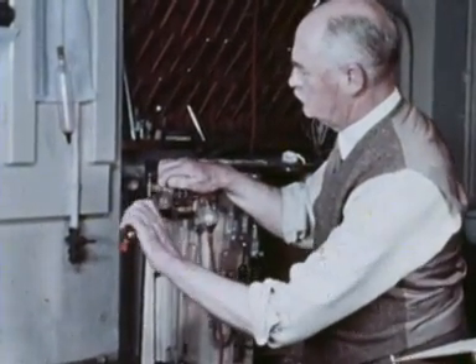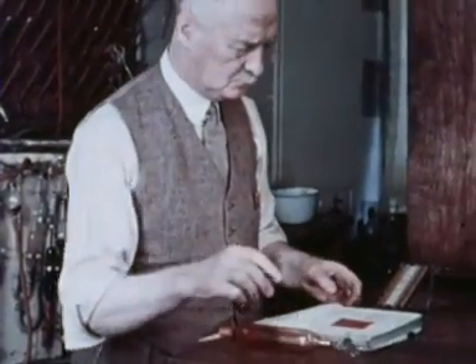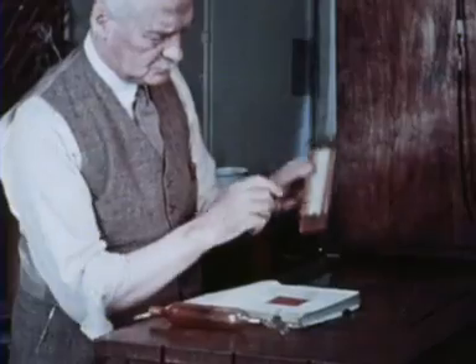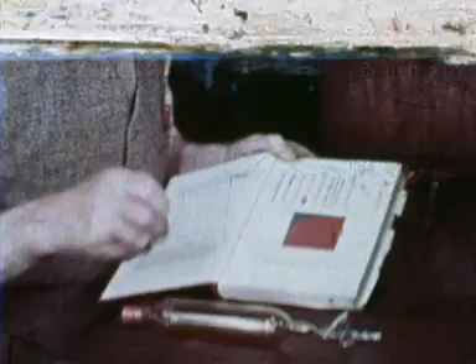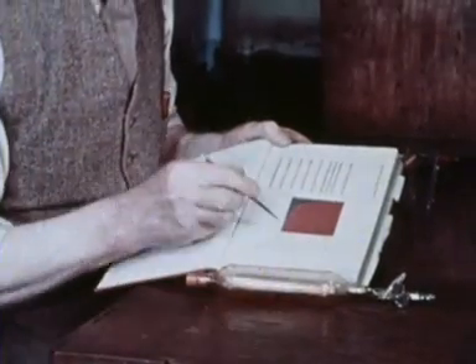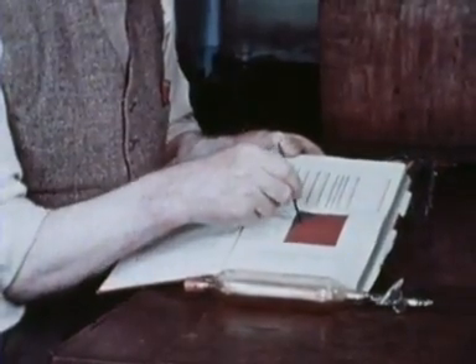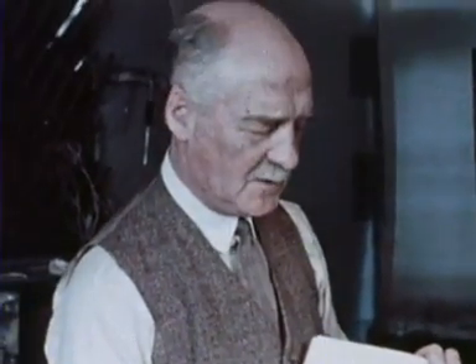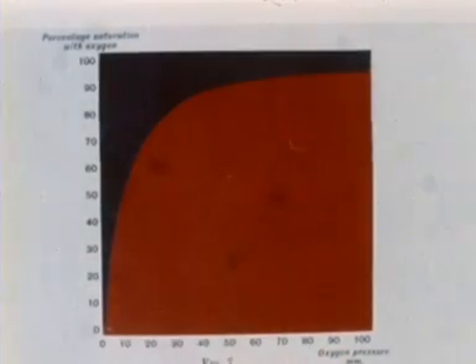So now he can start to plot his dissociation curve. The vertical axis is the percentage saturation of the haemoglobin in the sample with oxygen, and this he plots against the oxygen partial pressure. With eight manometers and eight tonometers, each containing a different amount of oxygen, he could, and frequently did, plot a full dissociation curve — the curve which is the key to understanding the respiratory function of the blood.